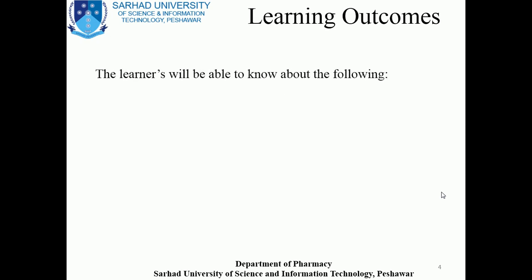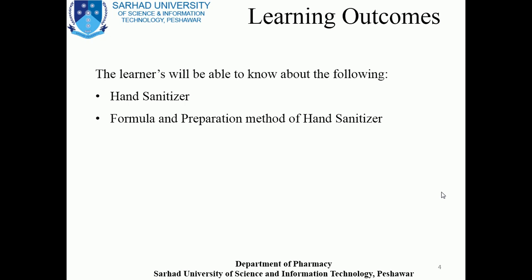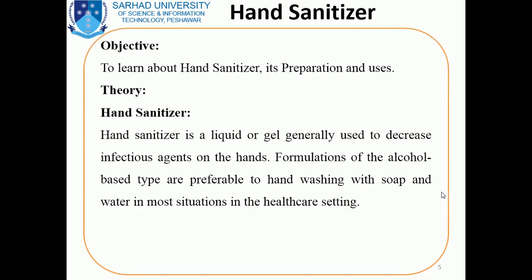Dear students, after the completion of this lecture, you will know about the hand sanitizer, that basically what is hand sanitizer and what is formula, and how we will practically prepare the hand sanitizer using the procedure and uses of the hand sanitizer.